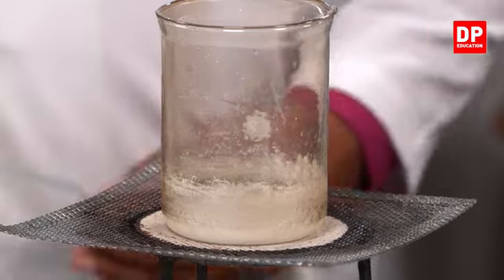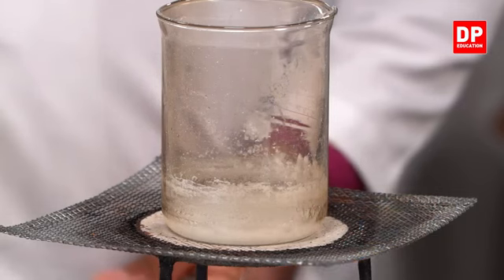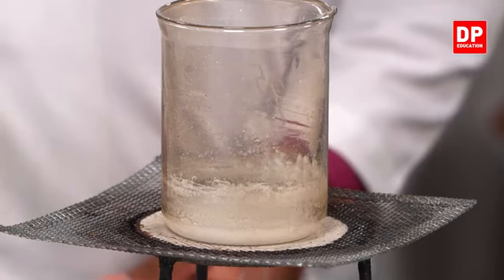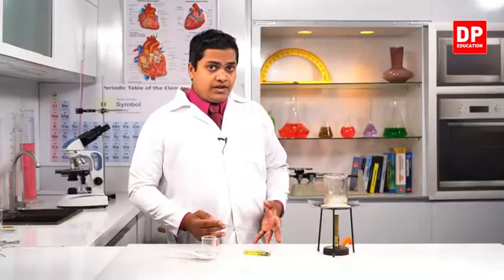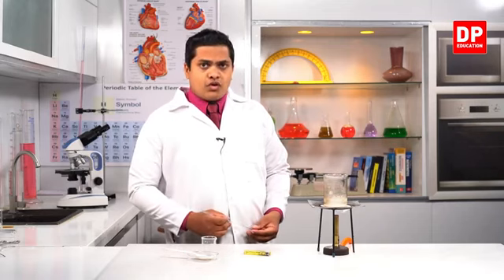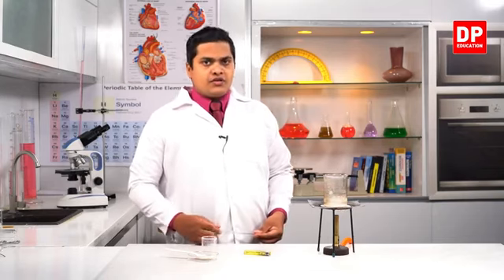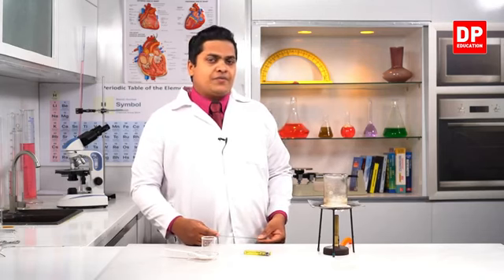So in here, even though we have dissolved salt in water, when heating, we can get the amount of salt which was dissolved earlier back as powder, right? Now if you measure the mass, you can get the same amount of salt which was dissolved earlier. It's because when dissolving salt in water, the composition of the salt is not getting changed.